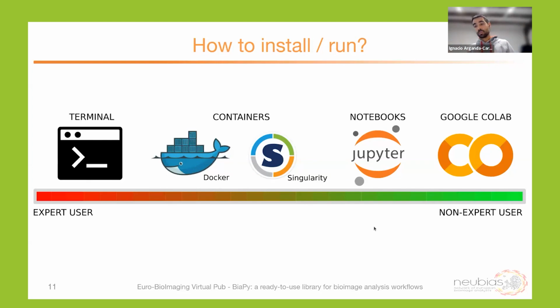And also for people who are not that familiar with that type of installation, we have notebooks that follow the successful zero-cost deep learning for microscopy philosophy, where there's no code, you just have to edit different menus, right? And we can also run them in Google Colab with real data. Of course, depending on your data, this may not be ideal. If you have very large data, you may have to jump into a local installation.